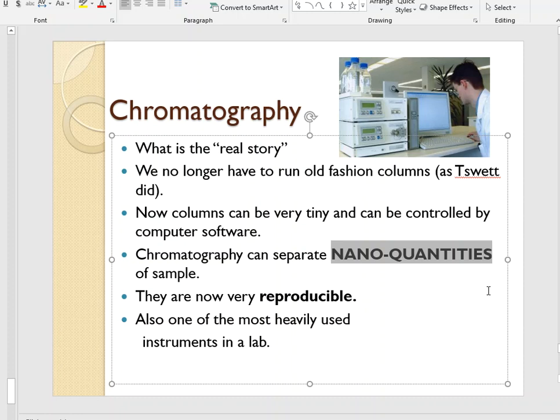And if you've used our microliter pipettes in the laboratory and you measure out 1 microliter, you know that that's just basically a fraction of a drop. You probably can't even see that volume with your own eyes. And then if you take 1,000th of that, we're now into the nano quantities, the nanoliter volumes. So really fractions of a fraction of a drop is what we're talking about.